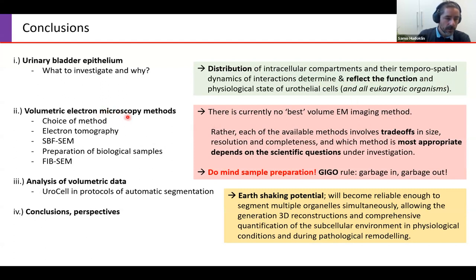For the volume EM methods, there are several options. Currently, no best volume EM imaging method exists. It's very much based on your question, your needs, and of course, each of the techniques has some pluses and minuses, so you have to consider this.